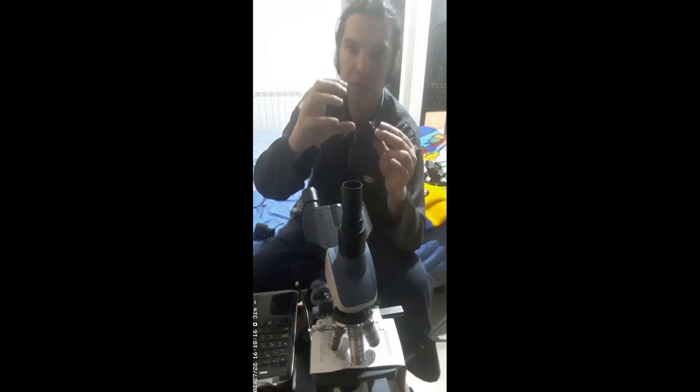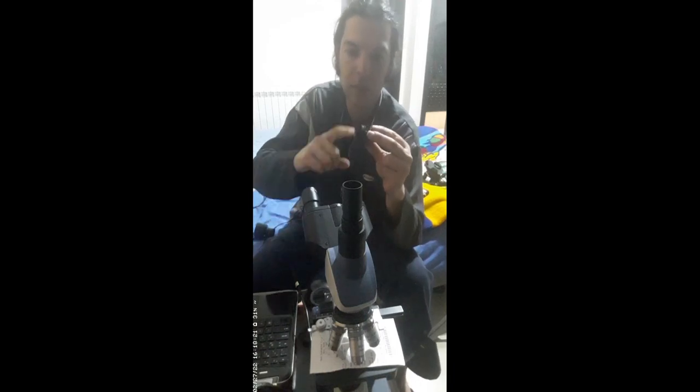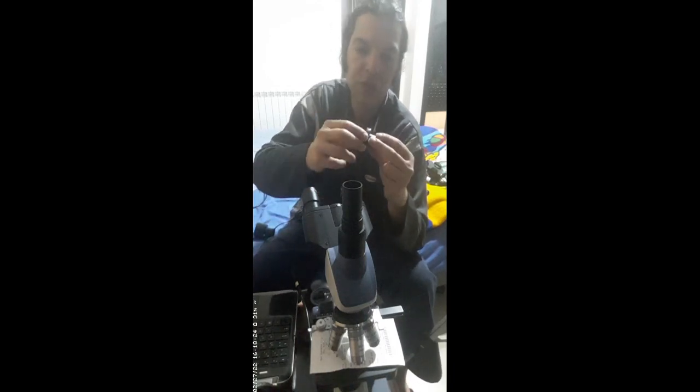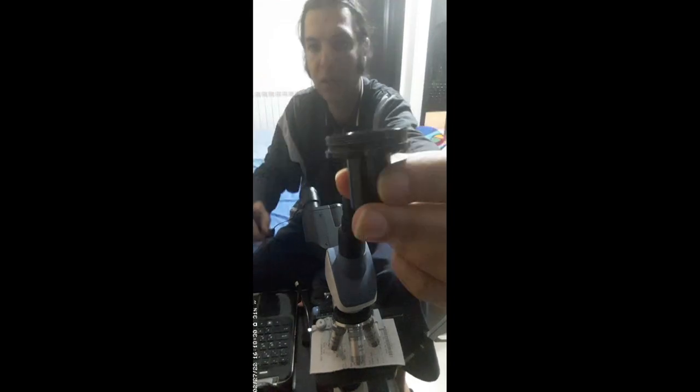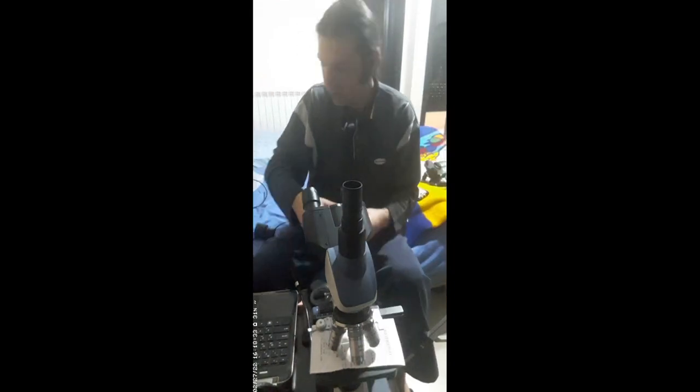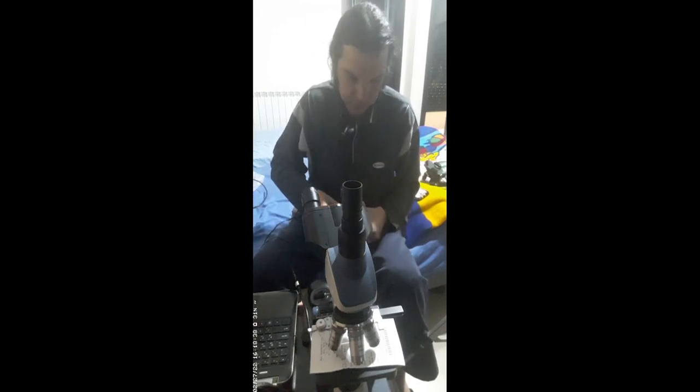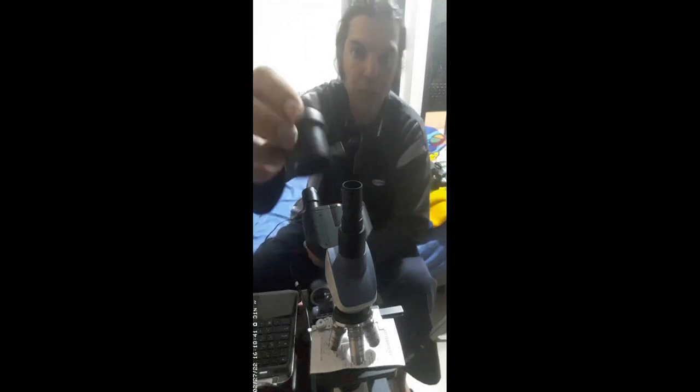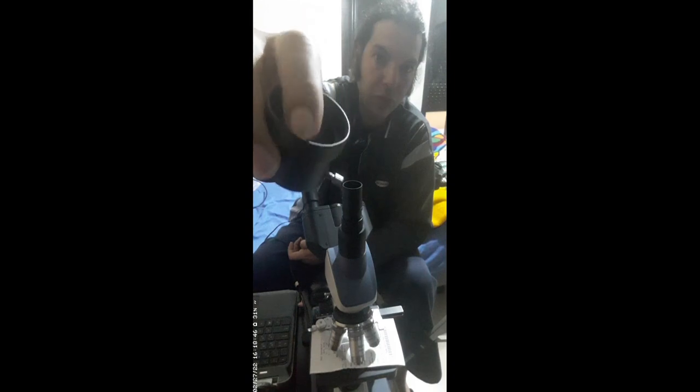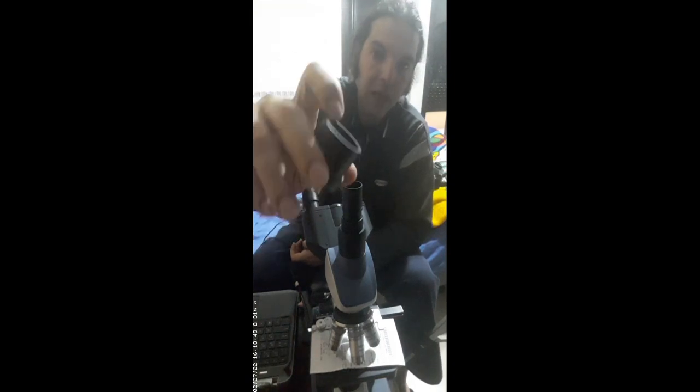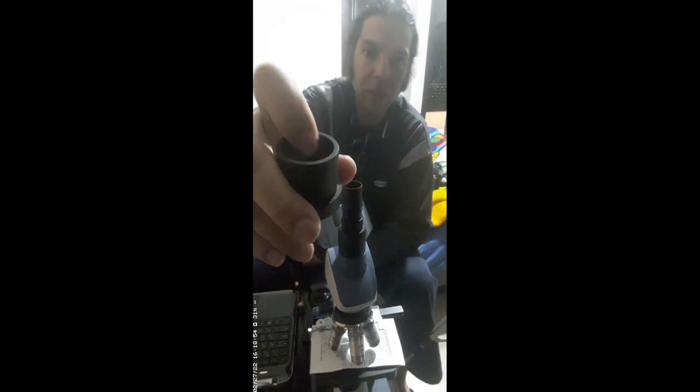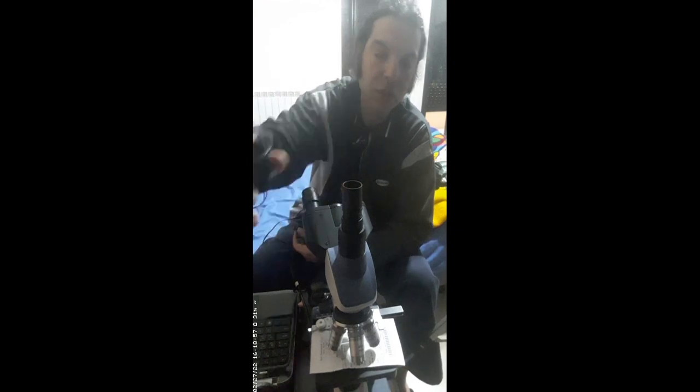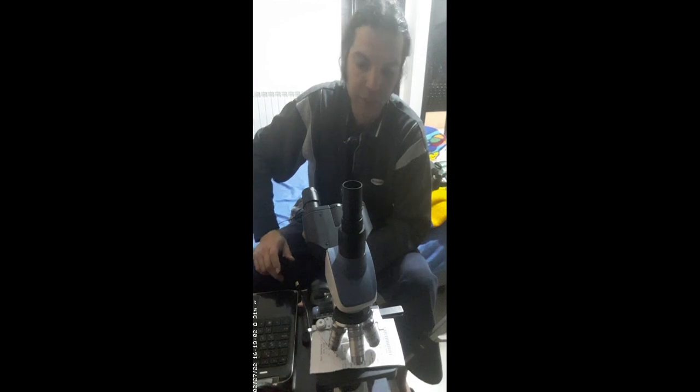This side here, the threads are called M42. You have to get also another adapter, which is this one. This takes from this side the M42. I have to repeat them multiple times so you can remember and memorize. Here I have an insert for the 1.25-inch eyepieces of the telescopes.